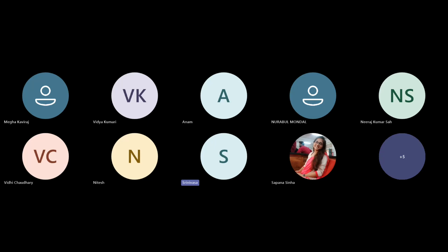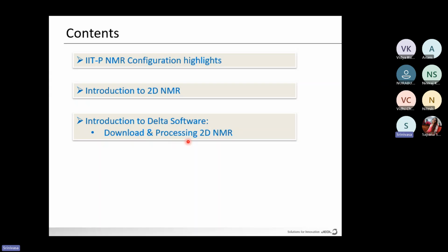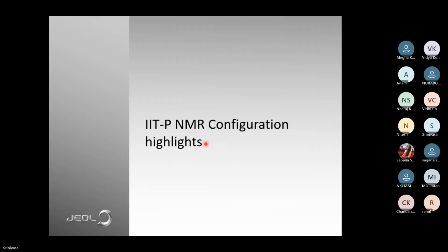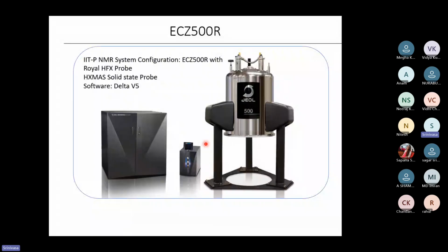Then I'll show the processing of 2D NMR. What I'll do is I will just open the actual software and demonstrate how to do the processing of the 2D experiment in Delta software. Okay, let's begin.